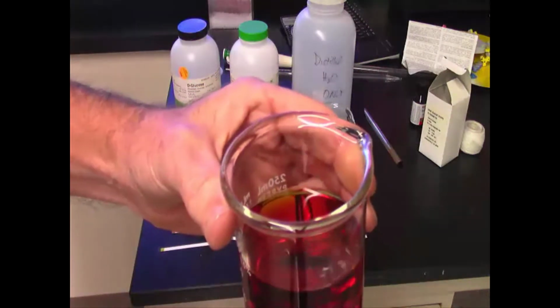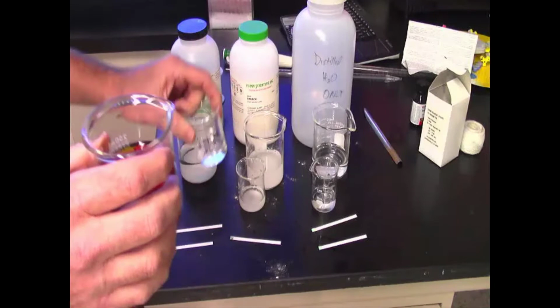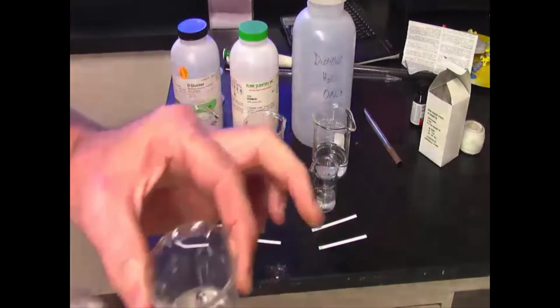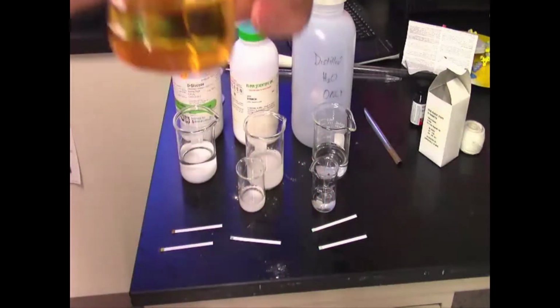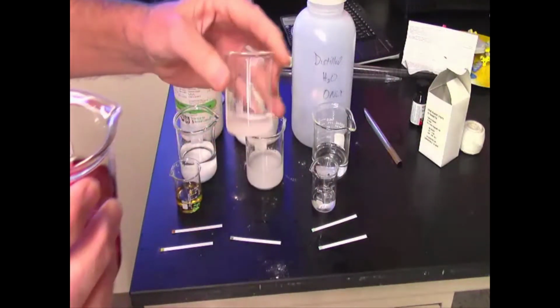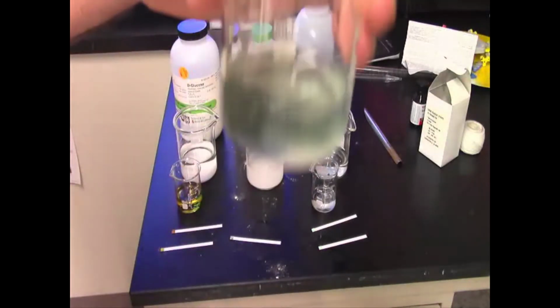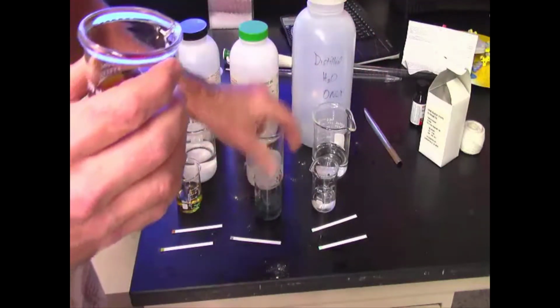And so this is iodine, and iodine should turn starch a bluish color. So here I've got a sample of glucose solution, and I pour this in there, and it's kind of the same color except diluted out. So that indicates no starch. So here's solution with starch in it. I wouldn't be surprised if we see some dark blue, and there it is. So that's a test for starch.